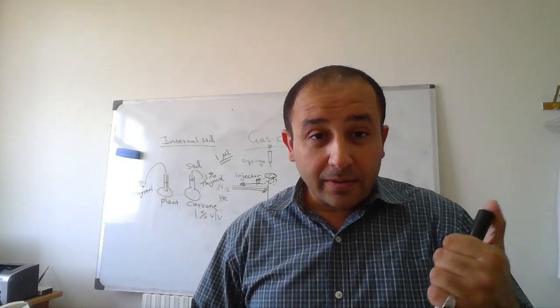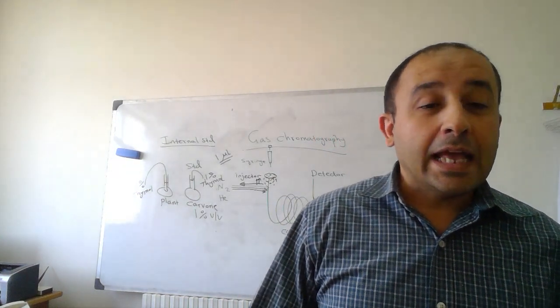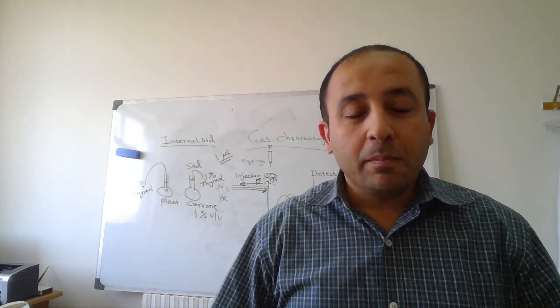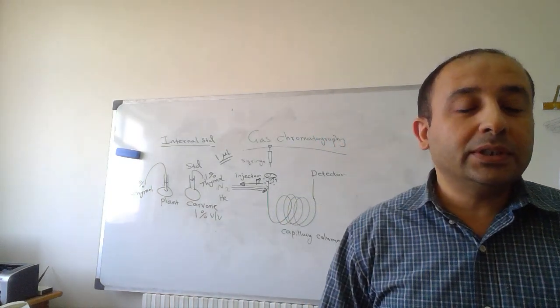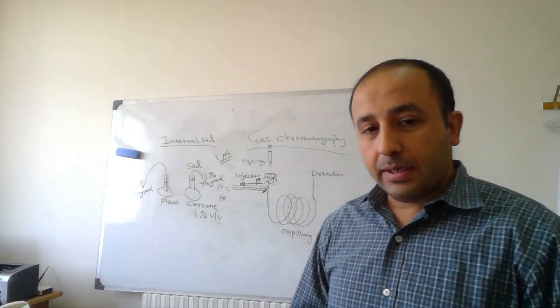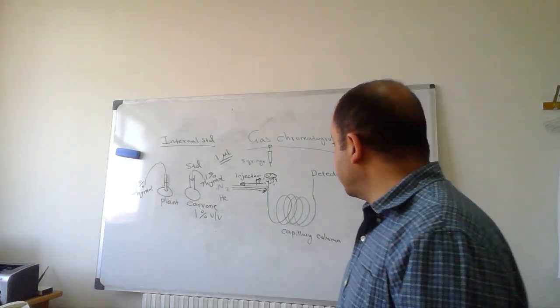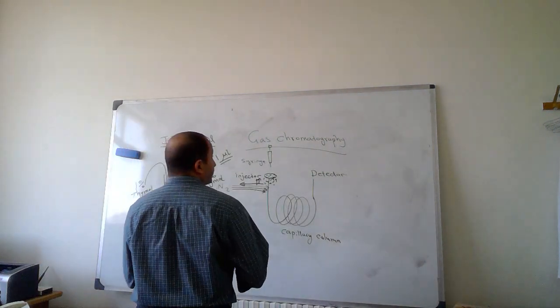If we have error, then this will be reflected on the internal standard. And mathematically, we can make adjustment of the calculation according to the thymol quantity. Okay?